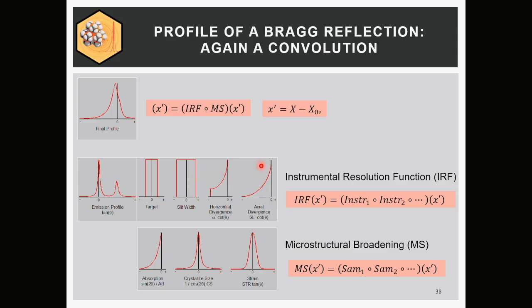Remember, we have Bragg cones, so what we measure is the rings, and if we have a very small ring and the detector has a finite size, the detector will see the ring well before actually there's the maximum, so the intensity will go up, and once it's behind, it will fall down, which is the main reason for the axial divergence. If you have a big ring, it's like this, that doesn't play a role anymore.